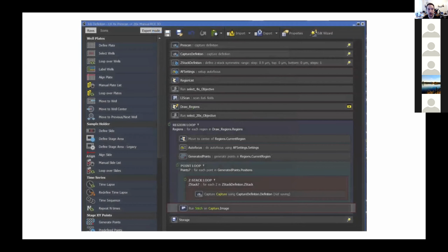And so the way that you can start to think about these projects is using a different tool called Jobs. And you may be already somewhat familiar with these from the jobs that we built when we purchased the system. And a good example of that is the jobs that we have for automatically scanning slides so that you can then focus on tissue sections. But the idea is just today to introduce you to how you can use these jobs yourself and start to think about how you might want to apply them to your research. And of course, we'll go through some simple examples today just to highlight what's possible and then get you more interested. And of course, we can help you down the line in terms of building more complicated ones.